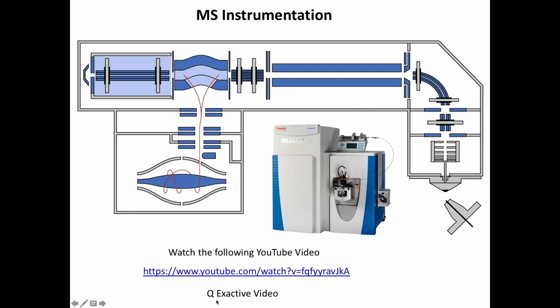The mass spec instrumentation, we have several Orbitrap instruments. I'm not going to go through this. There's a nice video here. I guess everyone has access to the slides. Is that right, Art? Yeah. So if you click on this, Thermo has a nice video of how the instrument will do mass measurement and MS/MS. Basically, the mass spec is composed of the ion source. This is where the HPLC is going to be coupled. Electrospray happens here. Ions get brought into the instrument, focused. Neutrals are removed. Then in the first region, you can do mass selection for an MS/MS experiment, fragment it, and then push them into the mass analyzer. For MS1, you're just going to push the ions into the mass analyzer.